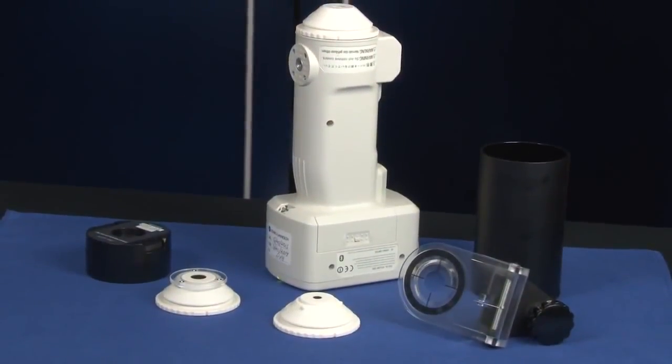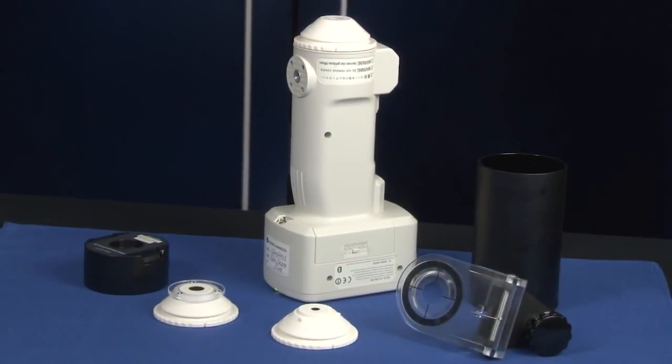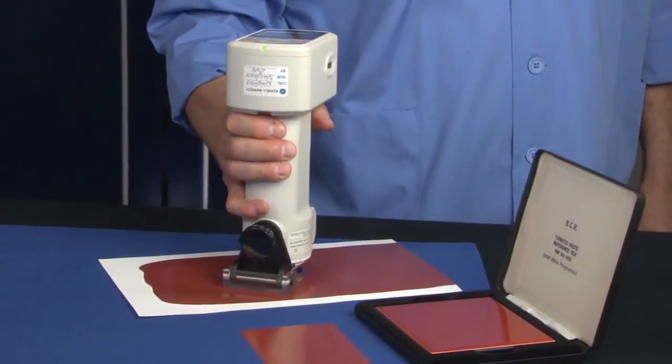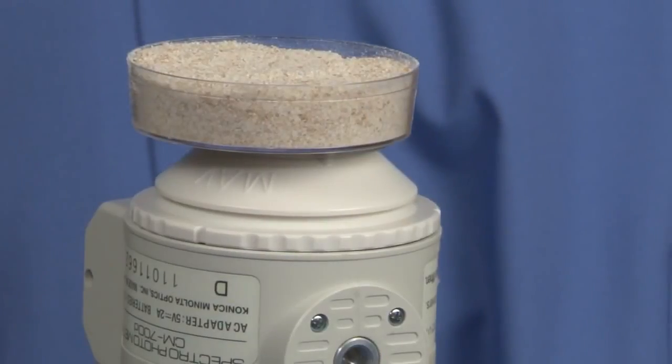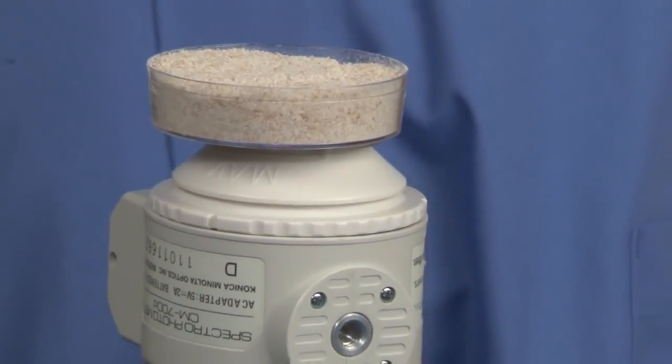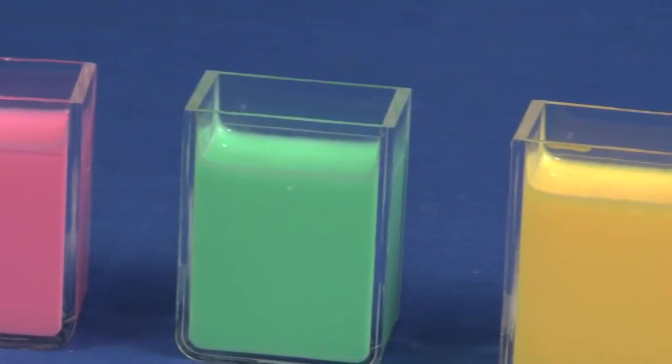The design of the CM700D with optional accessories make it suitable for precise and repeated color measurement of samples with a variety of surfaces and properties, such as flat surfaces, curved surfaces, and wet samples.